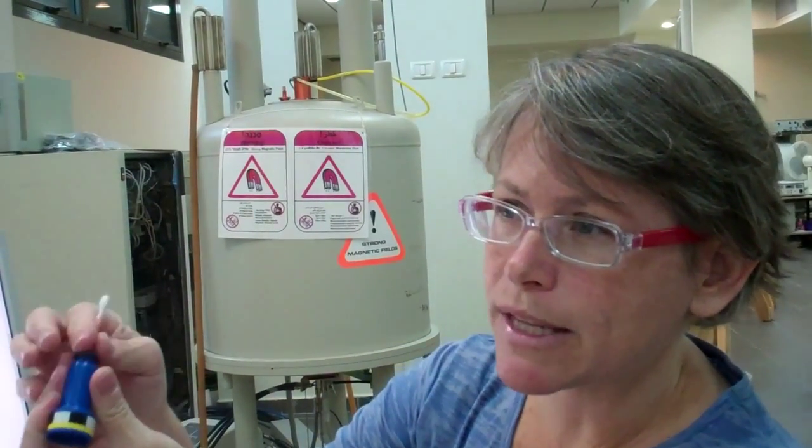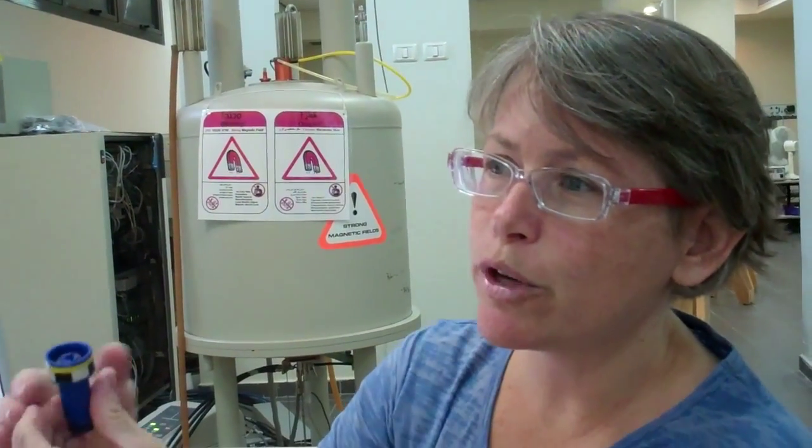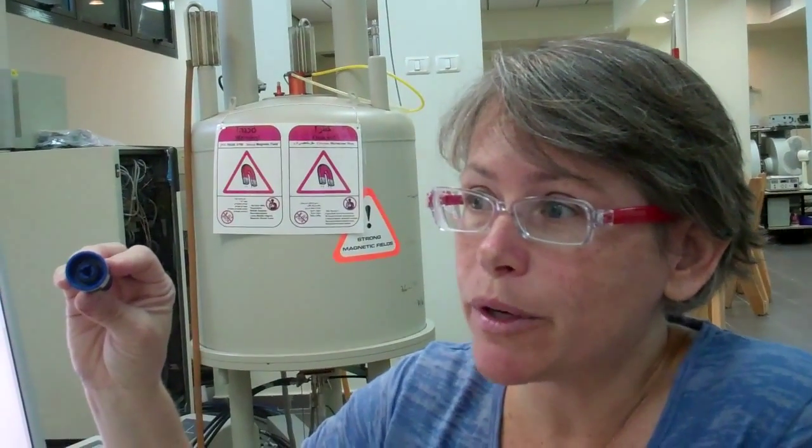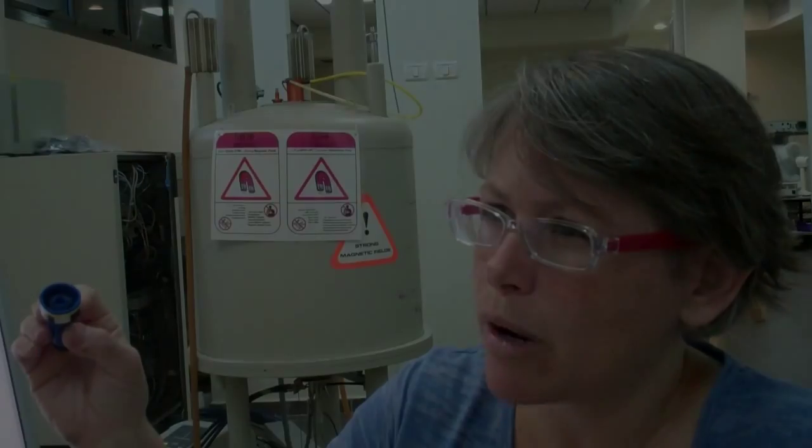We have cotton swabs on the desktops to remove crud from the inside of the spinner before you put it into the magnet. This reduces downtime on the spectrometer, keeps the instrumentation in good condition, and prevents your sample from having spinning problems.